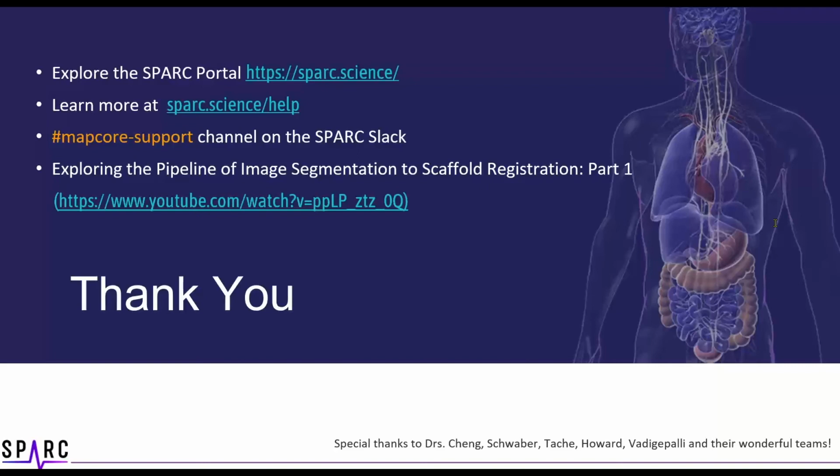When it shows up on the portal and somebody clicks on a specific group of cells, the name of that cell group will show up in the legend as well. So it will be color coded and the corresponding name will be on the platform. People will also be able to search based on the name of the cell group. Does that make sense? Yes, thank you.